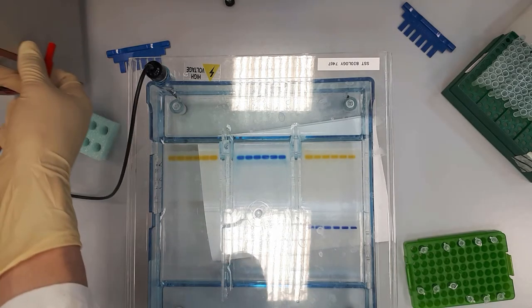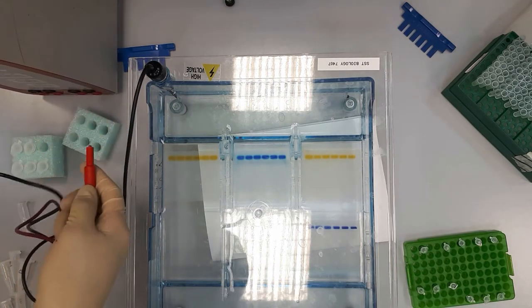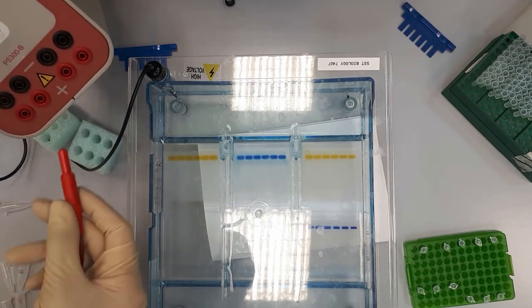Now we want to connect them to the power supply. Of course, red goes to red and black goes to black.